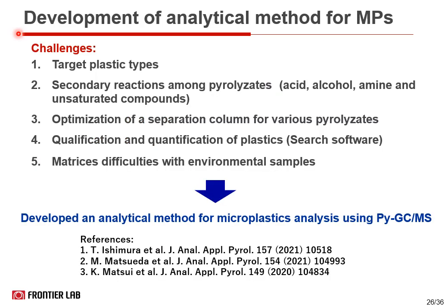Unlike industrial polymer products, analysis of environmental microplastics using Py-GCMS faces these challenges. For instance, we don't know what kind of organics and inorganics are contained in an environmental sample. We have to consider the secondary reactions among pyrolysates due to the unknown organics and inorganics.